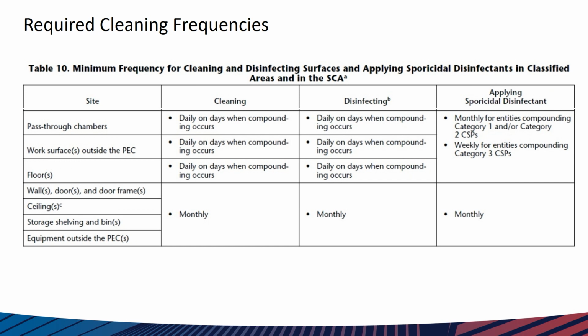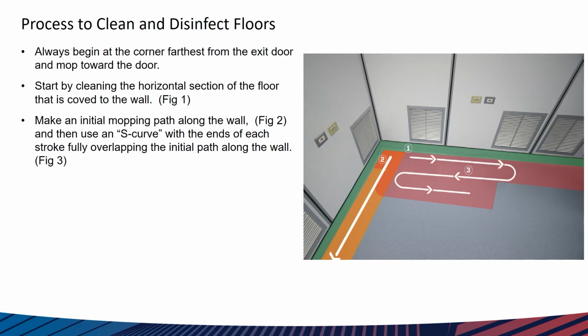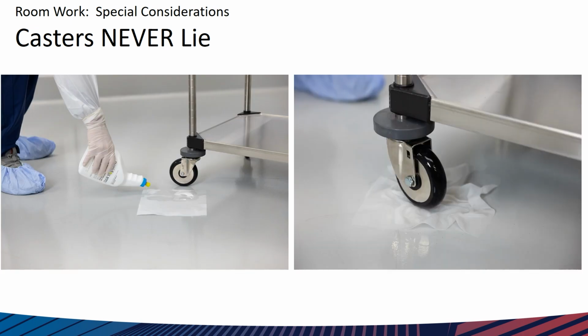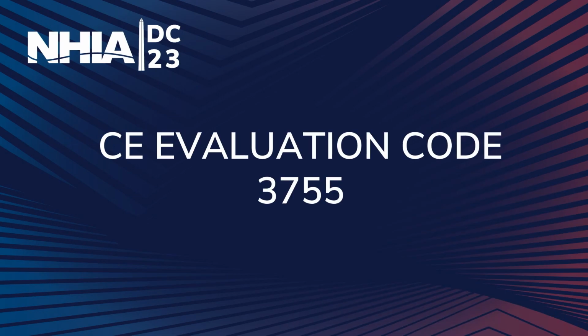One of the things that I do like to do is recommend that you have a sampling plan post-cleaning. It's a sampling plan, and there are no inspectors in here, I don't think. That's not information that I give to the inspector. That's something you keep for yourself as a for-information-only document. That's extra, way beyond what's needed for the chapter, and that's for you to remediate any cleaning issue that you happen to come across.